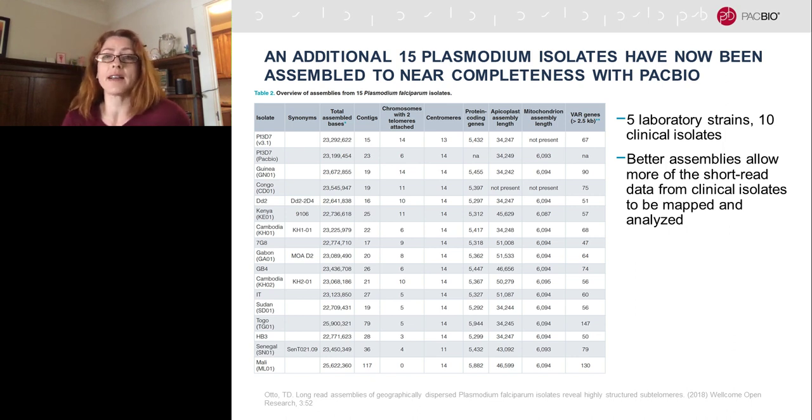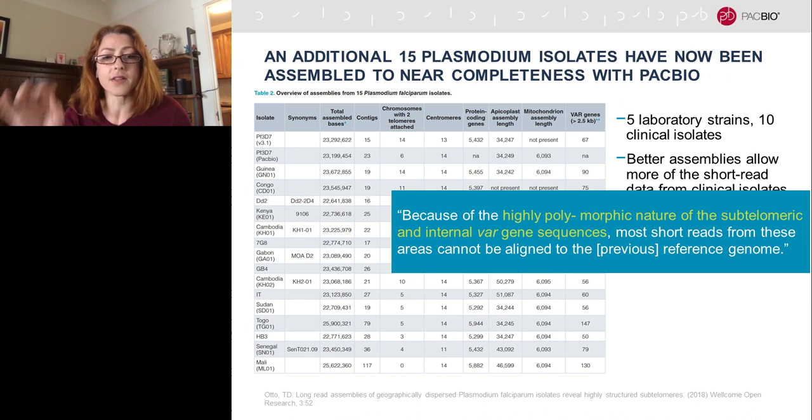When you have a highly contiguous assembly, that makes the short read data that you have in hand much more useful, right? Because short reads can be mapped to a higher quality assembly and allow you to understand whether the genes within those reads have been rearranged or are in their same place, or whether there are additional variants. All manner of questions like that are a lot easier to address once you at least have a high quality reference genome that you can use to analyze those strains.